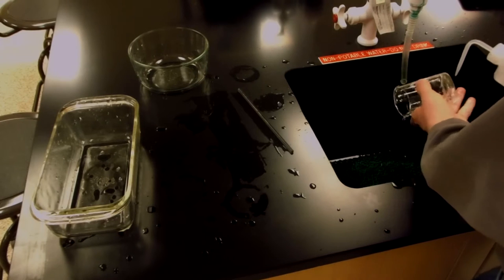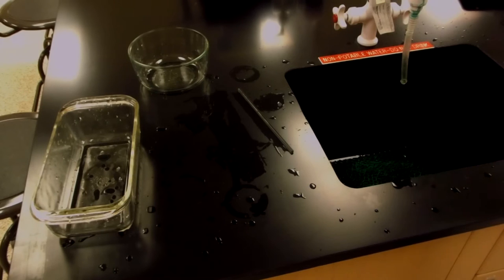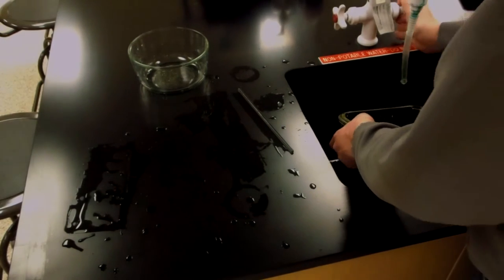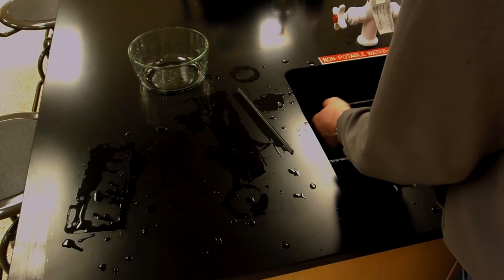Now, however, these larger Pyrex dishes are a lot more time consuming. I rinse the glassware, and I clean the outside of the glass with the baking soda solution.